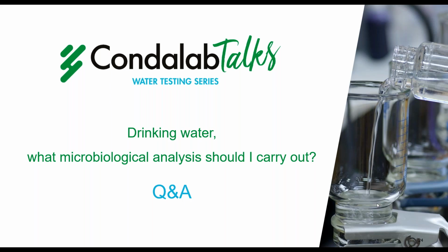Is Condachrome media ISO validated? I think you mean whether the Condachrome products are accredited by an organization. In that sense, no, but they have been validated internally and also by clients that are references in the beverage industry.